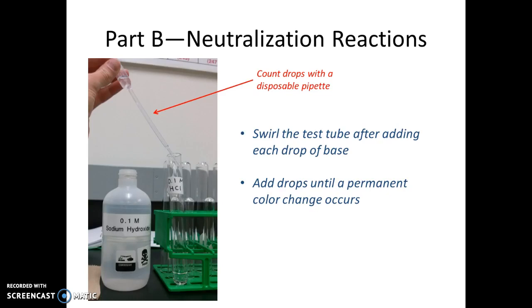Next, add the base: 0.1 M sodium hydroxide, counting drops carefully using another disposable pipette for uniform drops. Be very careful as you add the base — swirl the test tube to mix after each drop. I suggest working with your partner: one person adds and counts drops of base while the other holds the test tube and swirls it after each addition, ensuring thorough mixing.